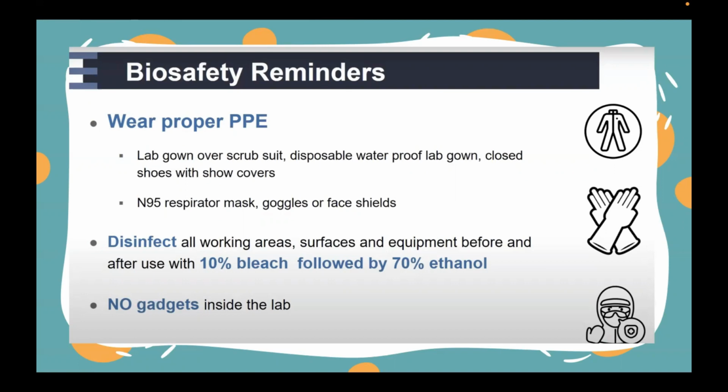Lab gown over scrub suit, disposable waterproof lab gown, closed shoes, and shoe covers. N95 respirator masks are being utilized when we're dealing with samples that produce aerosols, such as yung mga sputum natin and then yung mga nasopharyngeal swab. Again, N95 respirator masks are only used or being utilized if we're dealing with samples that produce aerosol.